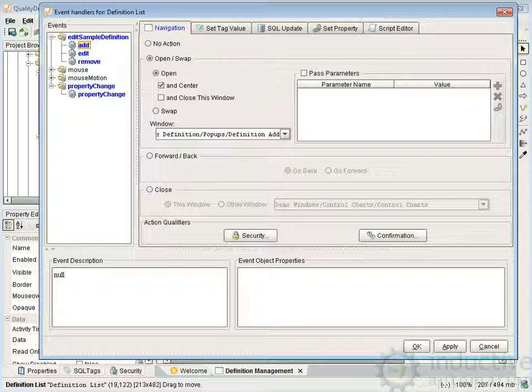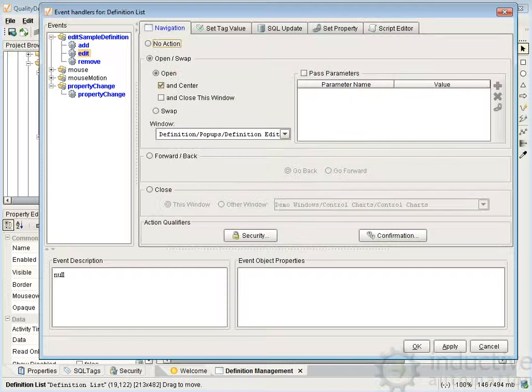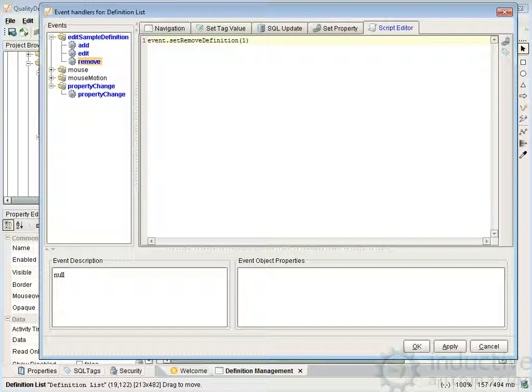We navigate to the definition add — we can take a look at the script it created to do that. We're just navigating to this window, displaying it, and centering it. The edit is very similar — the same as the add, only we're pulling up the definition edit. To remove, we can just say event.setRemoveDefinition to one. If you want other code in here, maybe a verification message to pop up asking 'are you sure,' or some other item, you can put it in this code before that line.